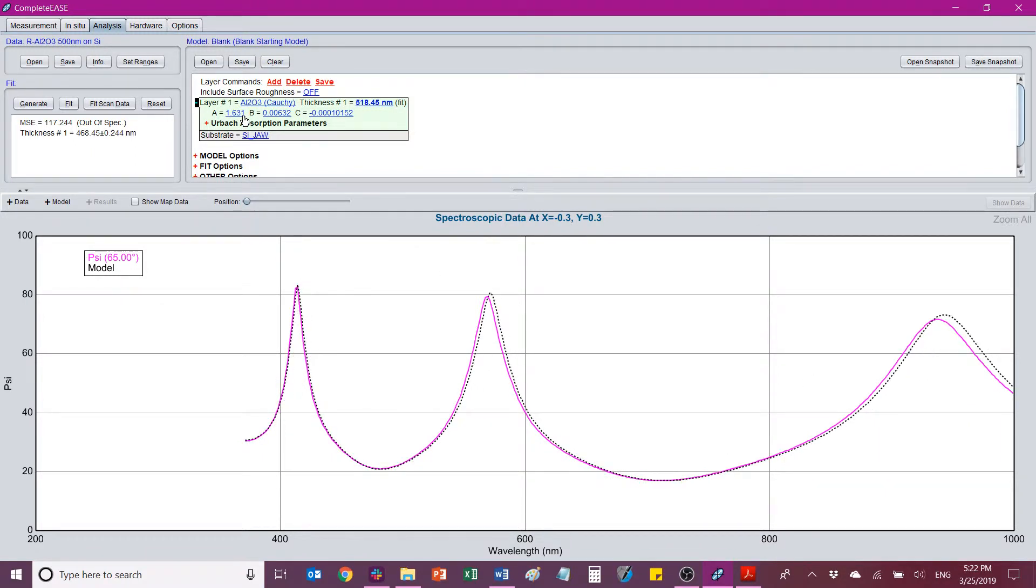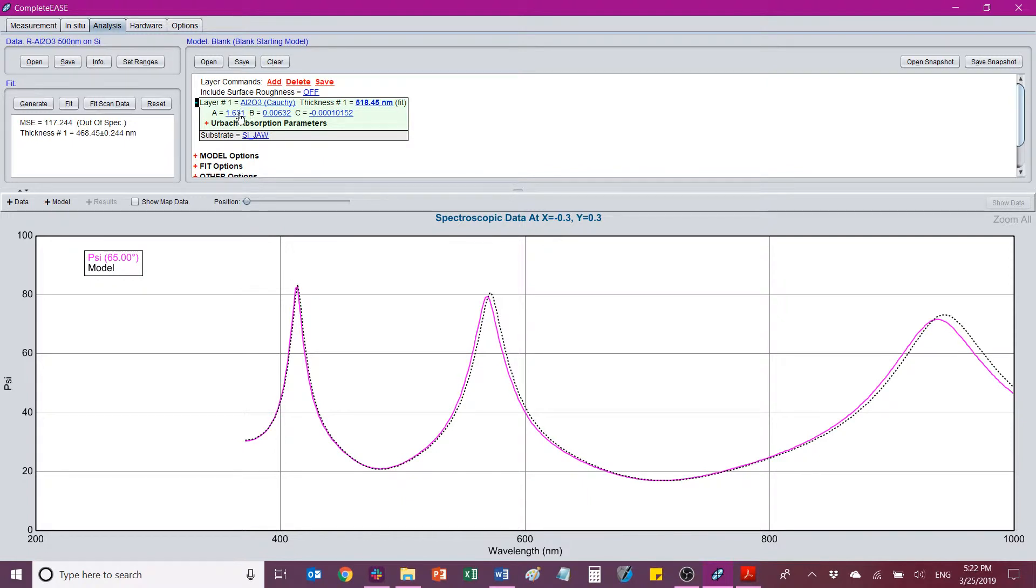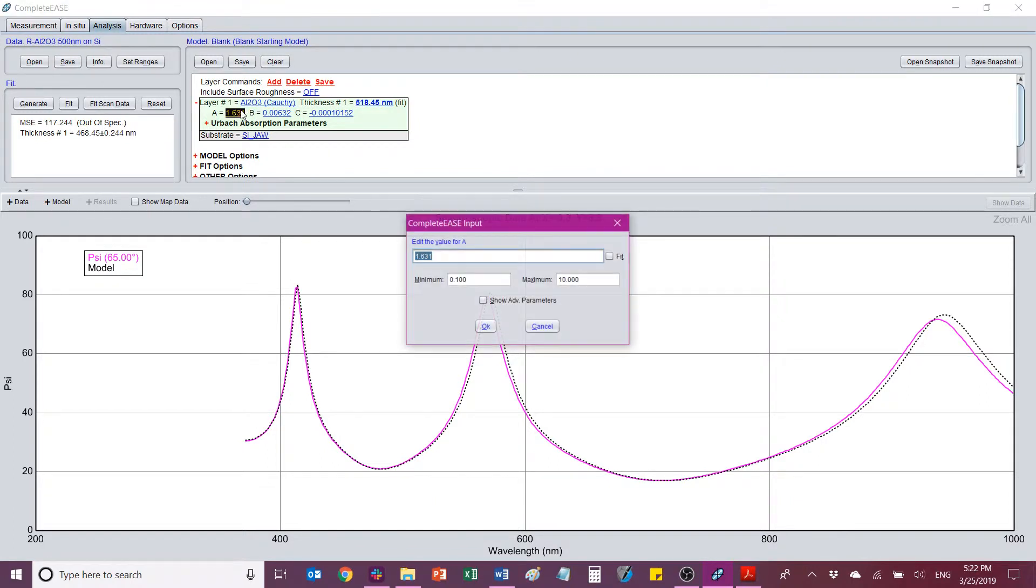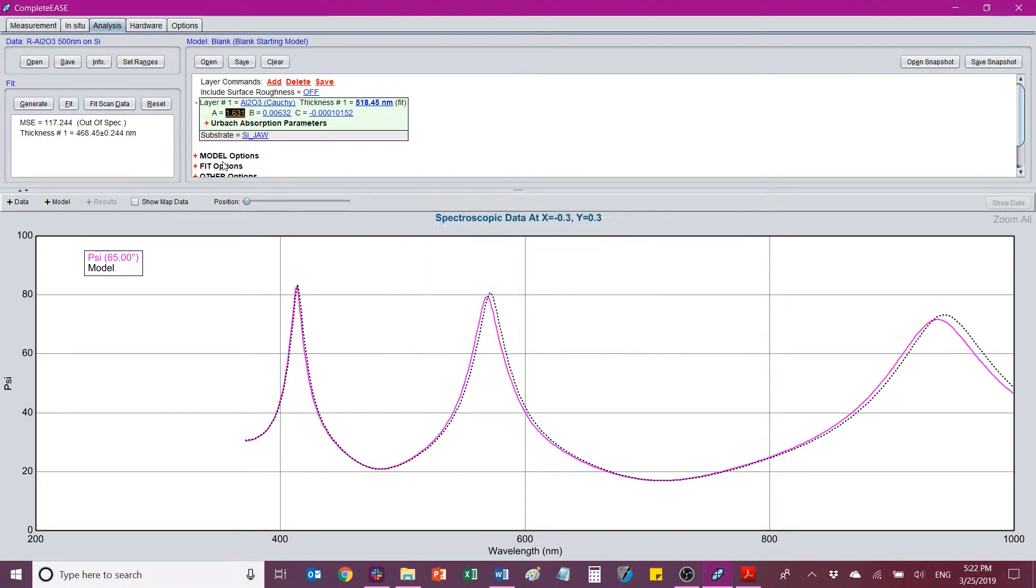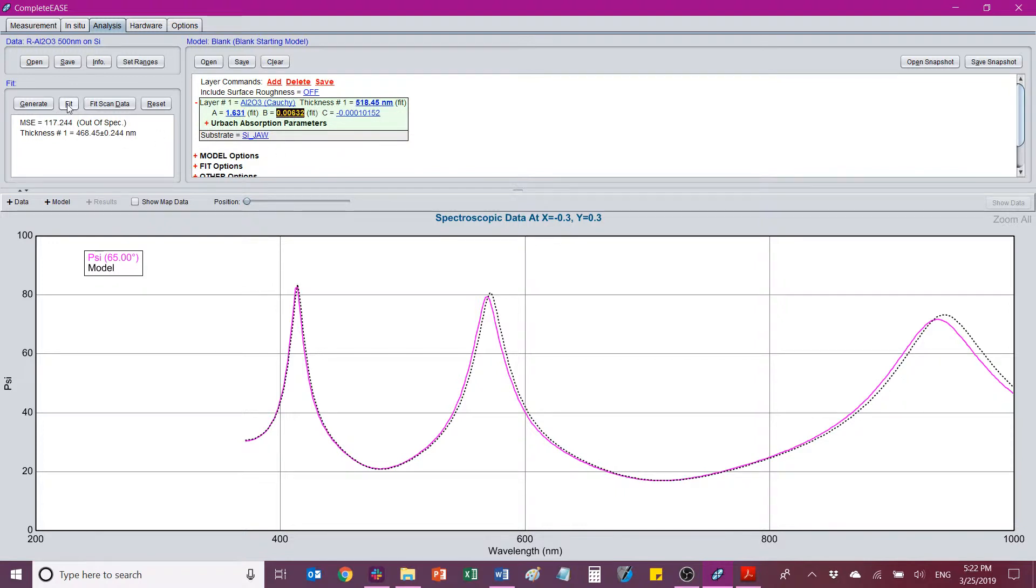And that's a little bit better. I'm going to move this back. If you hold Ctrl Shift, you can increment these by smaller amounts. Now, again, I'm holding Shift and using the mouse wheel to modify these on the fly without having to click them and type them in. But if I want, I can left click and I can type a value in. Okay, so that's not too bad. So this is pretty close. I'm just going to fit the thickness. I'll fit this parameter and I'll fit this parameter. And I'll hit fit. What do I get? Well, I get something that fits really well.